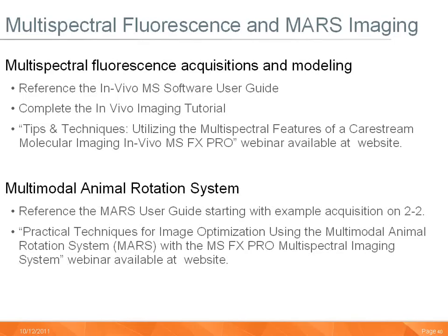The Mars system is also really beyond the scope of an initial introduction to the system. There are a couple of great webinars on the Mars unit. There's also an accompanying Mars unit user guide, and we recommend that you start out looking at the example protocol on page 2.1 and 2.2 of the Mars software user guide.